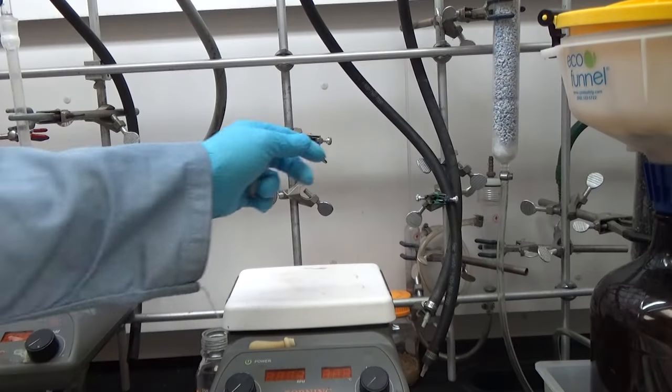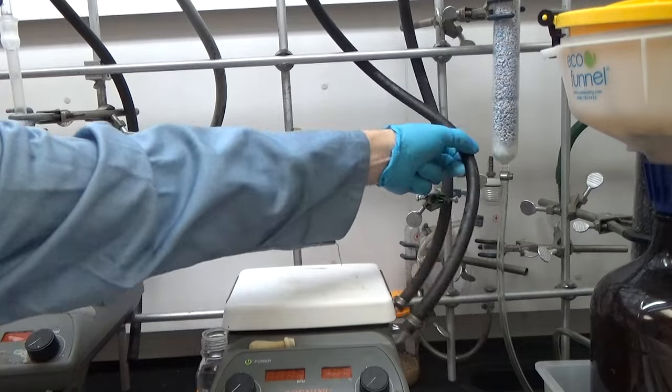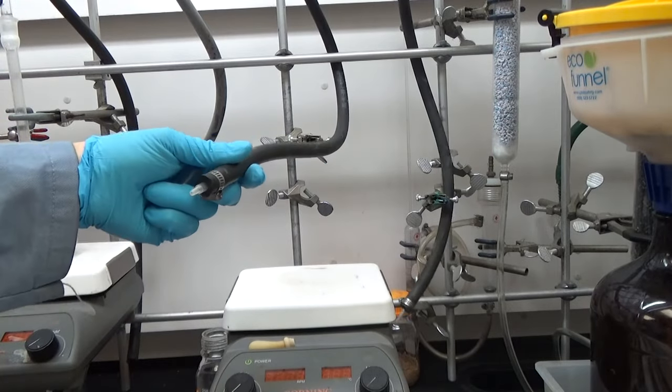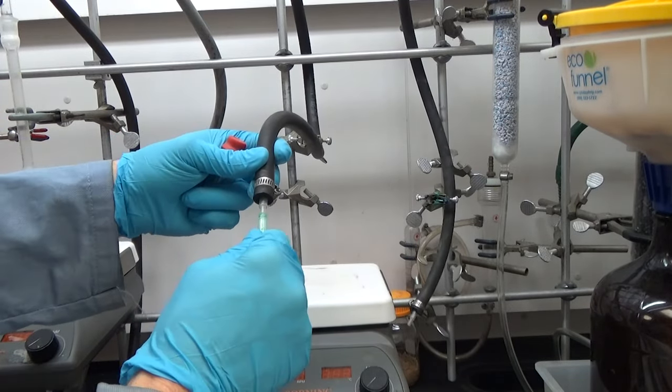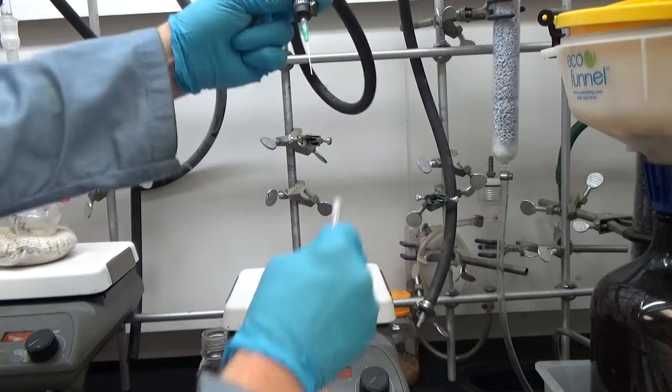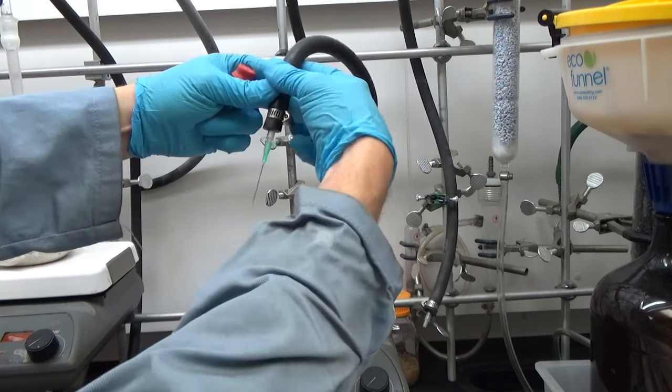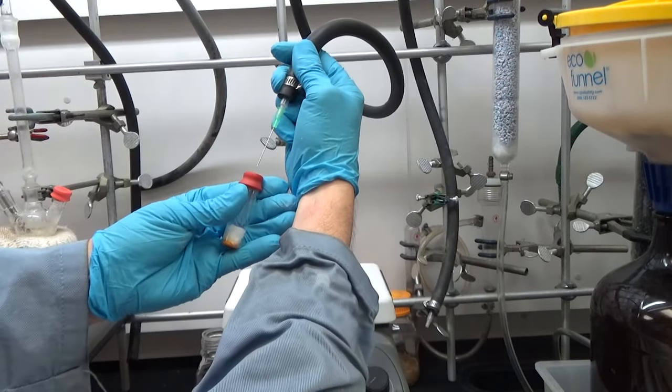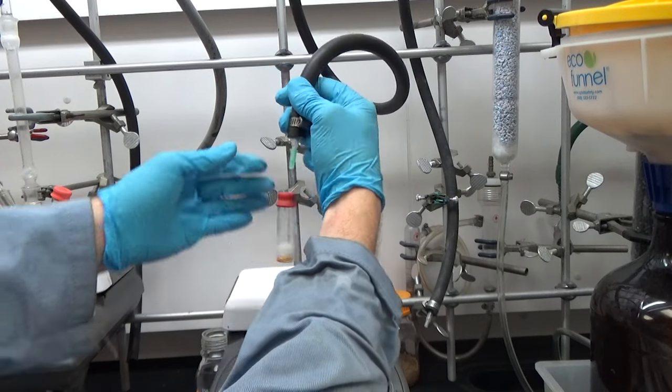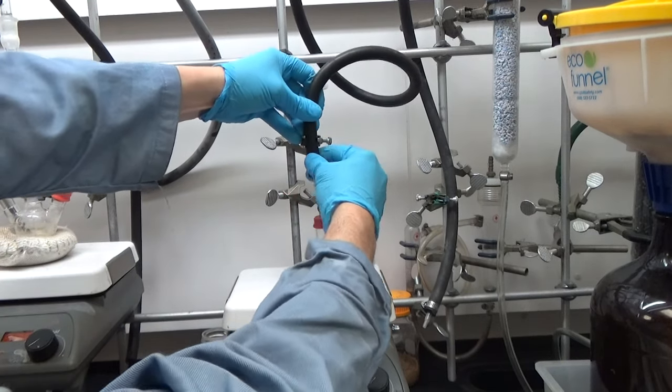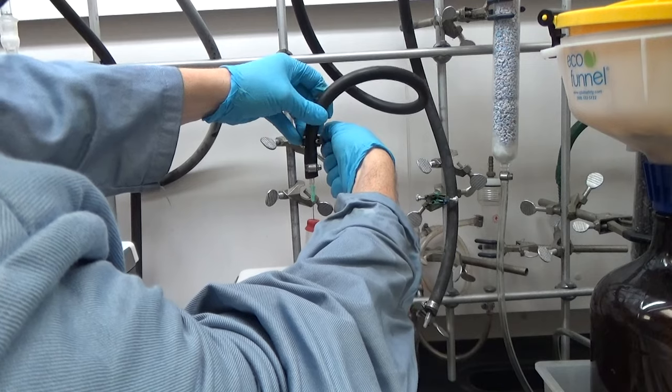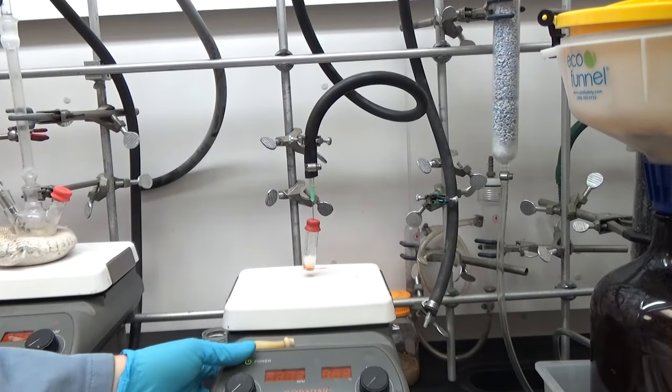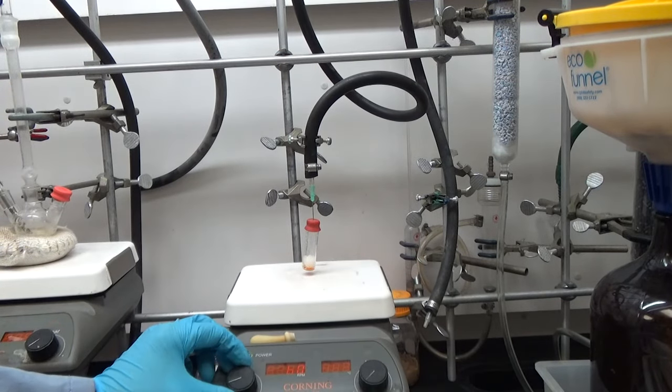Now what we're going to do is attach that to our Schlenk line. And what I've done is I've attached a syringe to the hose. That clamp is quite necessary. And I'm using a thin 21 gauge needle. Be careful when you take the cap off. And that just goes through the septa. It's pretty self-explanatory. Again, make sure the stir bar is in there. And as usual, I like to clamp things pretty tightly.